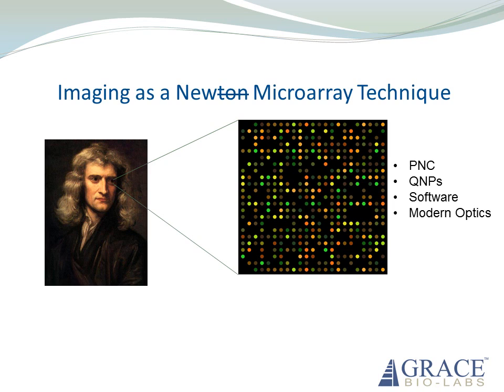Despite that digital scanning is a very sensitive, high-resolution technique, it is unfortunately an inherently slow process because each individual pixel in the scan must be obtained independently and sequentially. Scanning a single microscope slide can take as much as 3 minutes to complete, and commercially available digitizing scanners that are configured to scan a large array cluster, such as a 96-well microtiter plate, require many minutes to complete a full scan.